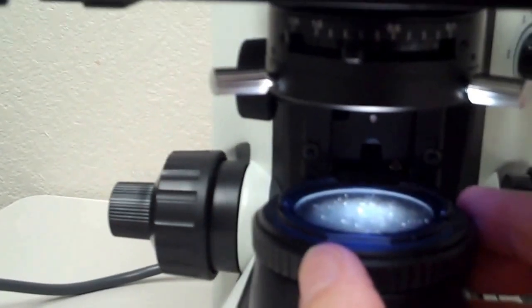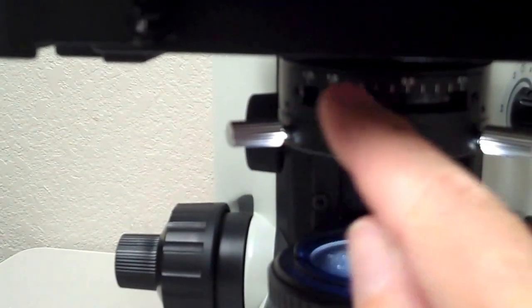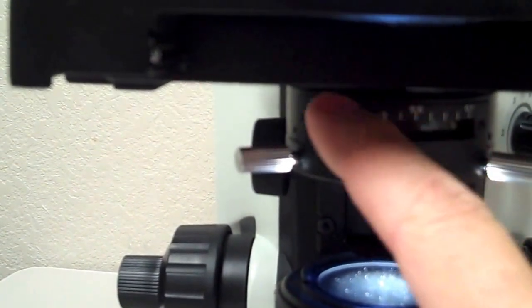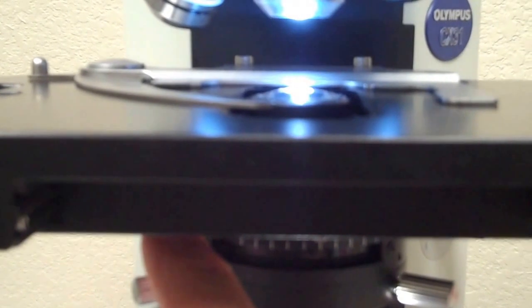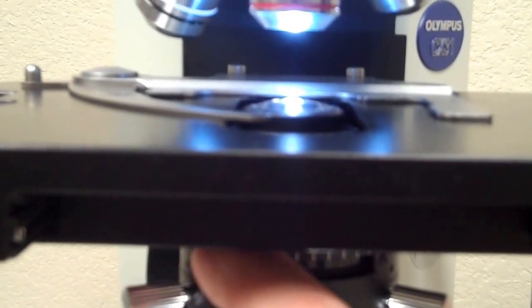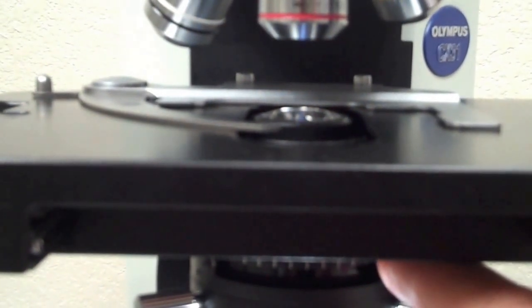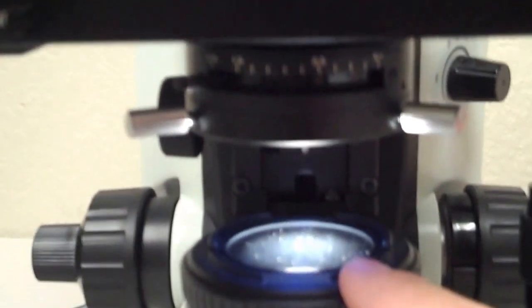Another way to control intensity of light is with the iris diaphragm. It's underneath the stage and it's a little black knob that you can move back and forth. With the base diaphragm all the way open, as I move the iris diaphragm over you can see less and less light coming into the microscope. So the base diaphragm and the iris diaphragm are two things that control the amount of light coming into the microscope.